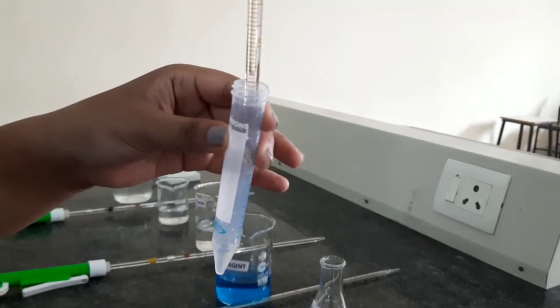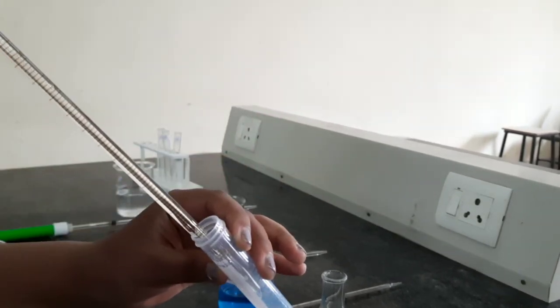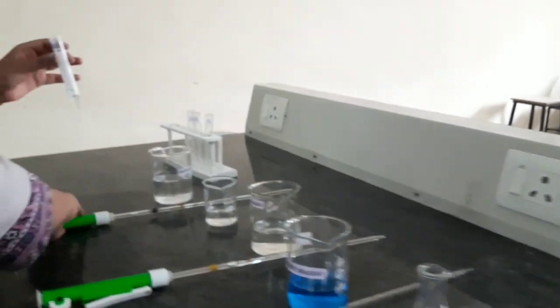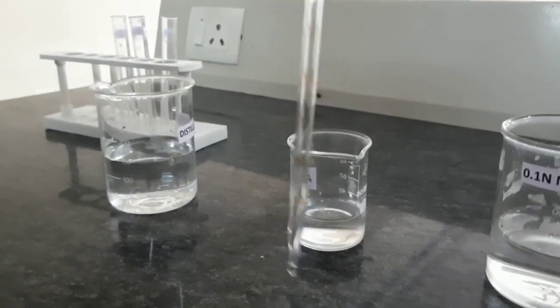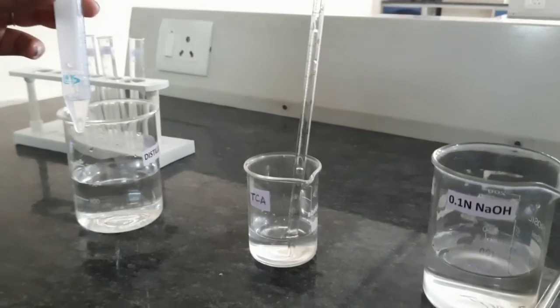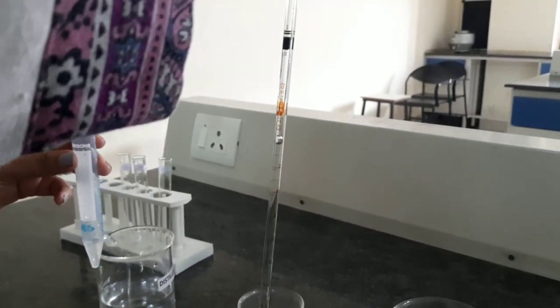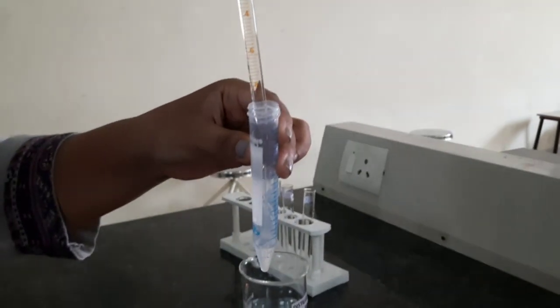To the 1 ml of urine sample, we will add 1 ml of trichloroacetic acid. We are going to add 1 ml of 20% trichloroacetic acid. After which we are going to centrifuge this sample.